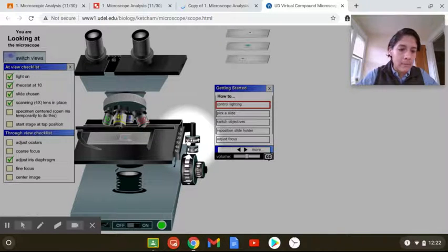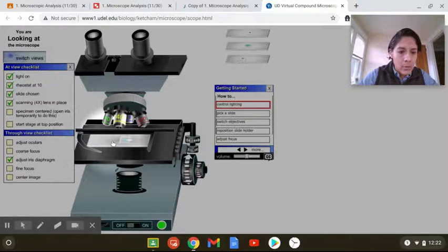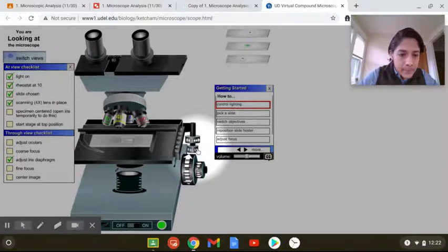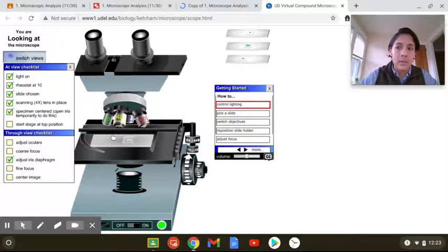It's moving down. When I think it's lined up, then we're almost there. Then I'm going to move it using the second set of switches to move it to the right. And that looks pretty good. That looks like it's right in the middle. And you're going to want to do this for all the samples so that you can see them.